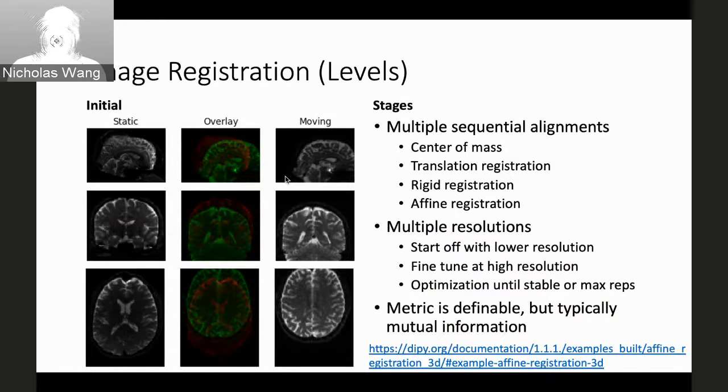And again, each of these, you start at low resolution registration, fine tune it a little more, and then fine tune it a little more in this kind of pyramid structure where you start off with the gross structure and then fine tune it across these multiple steps.